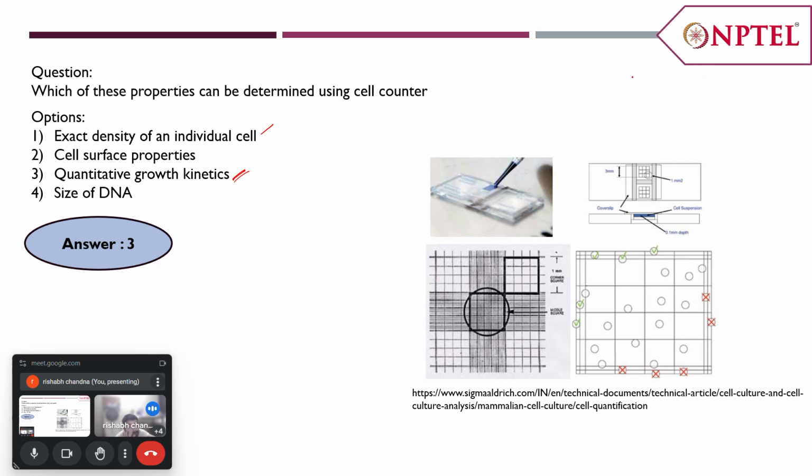Okay, so this is a slide kind of thing, and here we have two components. So first, this is the aerial view of the slide. So this is the glass slide, and in the middle we have certain box-like structures that are basically the area where we put our sample to count the cells. Okay, and first we place a cover slip before it, and then we add the sample, the diluted sample basically. And this is a typical mesh kind of structure present in that particular space.